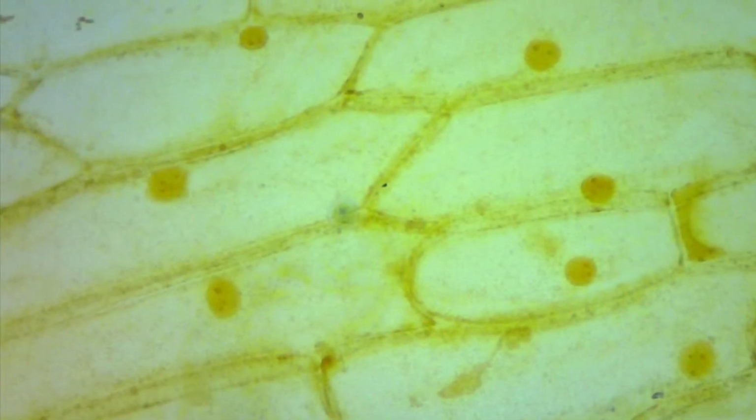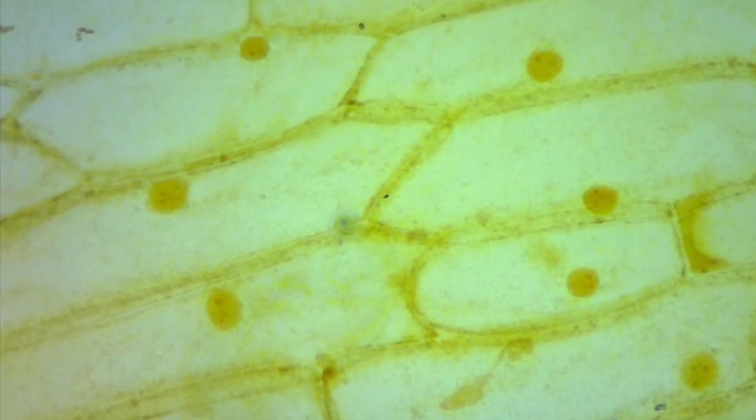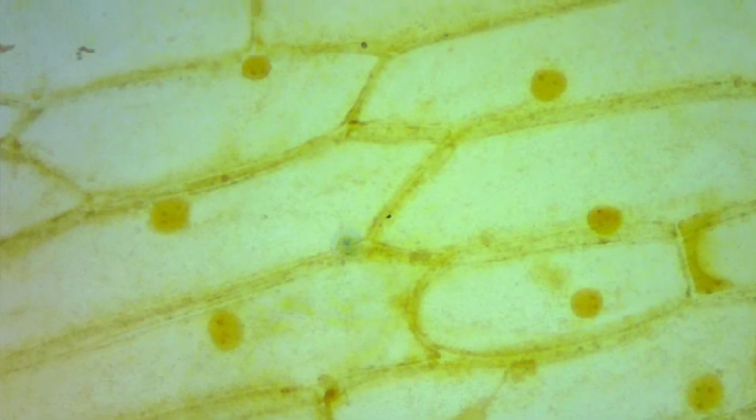There is also a plasma membrane lying adjacent to the cell walls. You are not going to be able to see the plasma membrane. The cell wall, though, protects the plasma membrane from bursting because of the intake of water.